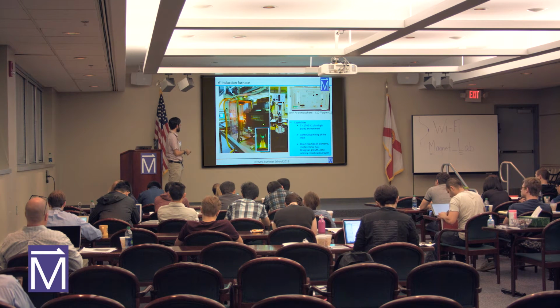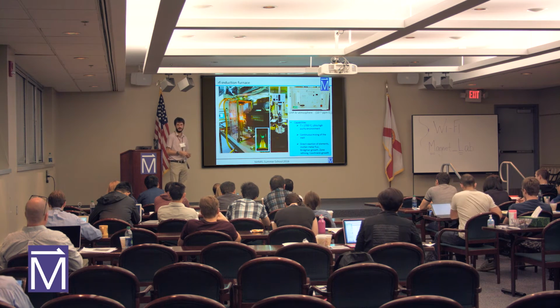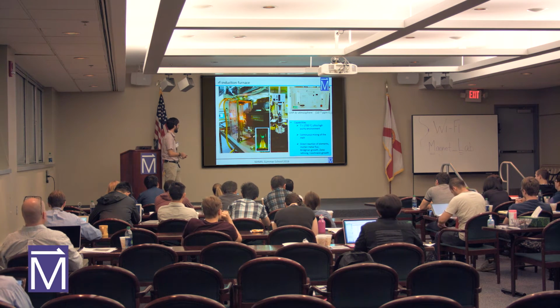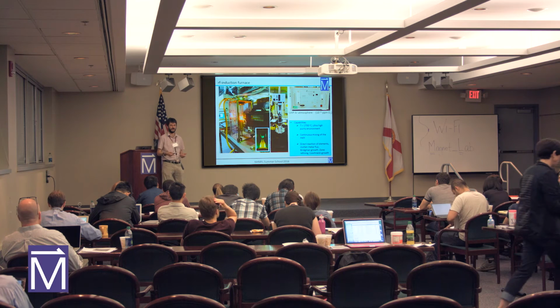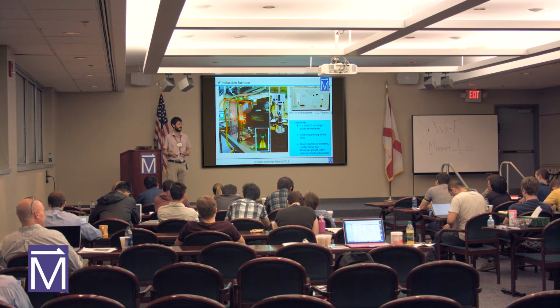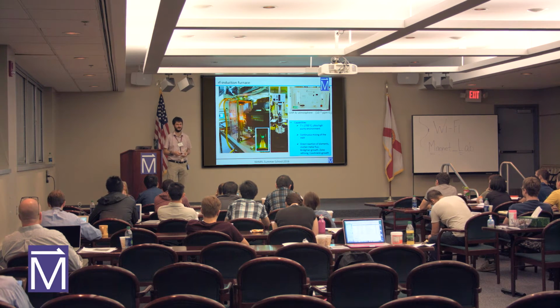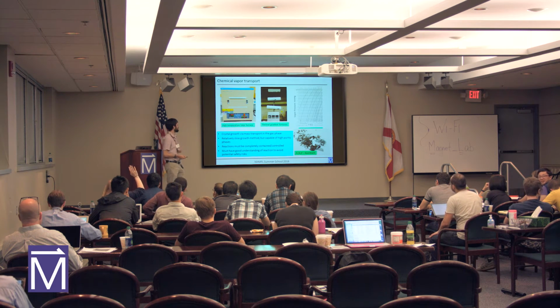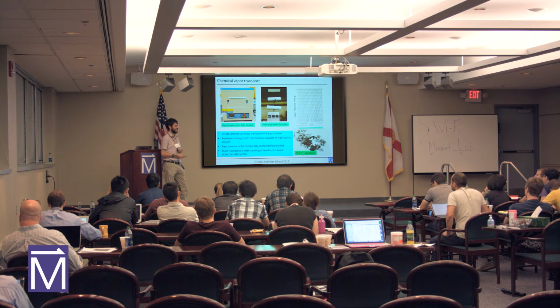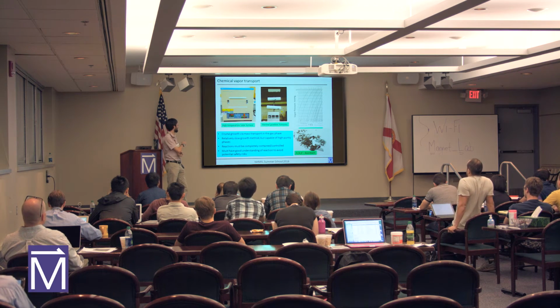If you can do that, and then insert a pulling finger that's made out of a material with a very high melting temperature, it's then possible to pull a single crystal out of that melt. And again, this relies on the material that you're trying to grow being a line compound. That's very important for this technique. Okay, so if you talk to me in 6 months, I might be able to help you grow single crystals this way. We're not quite there yet. Okay, one last crystal. I'm going to stop on this next slide after this one. And then we can talk informally about how to characterize them with X-ray diffraction.